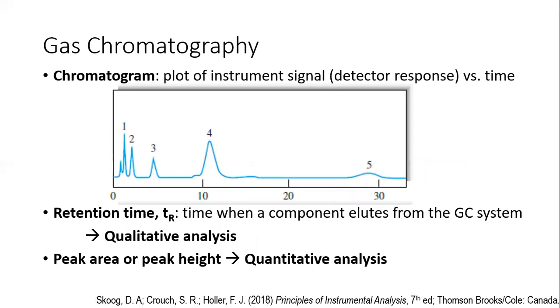So in gas chromatography, we will obtain a chromatogram. This is a plot of the instrument signal, or in this case, we're not really looking at the signal of the gas chromatograph, but rather the response of the detector versus the time at which a particular compound is detected.